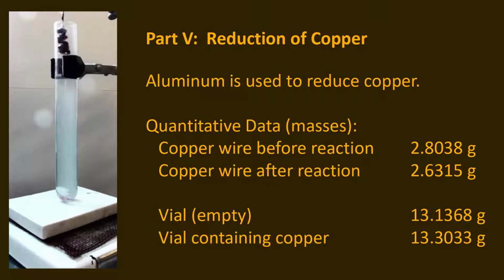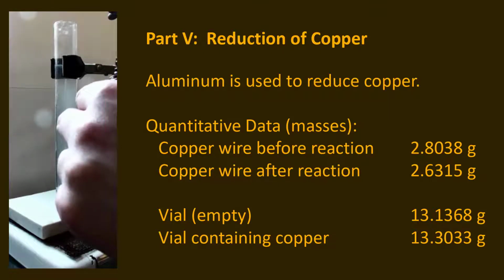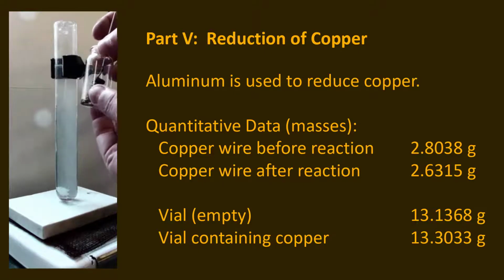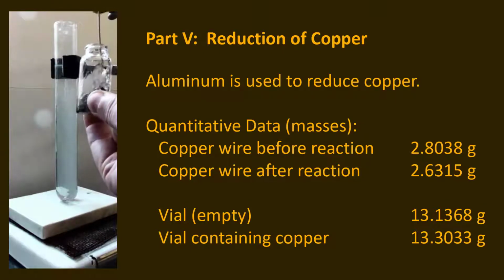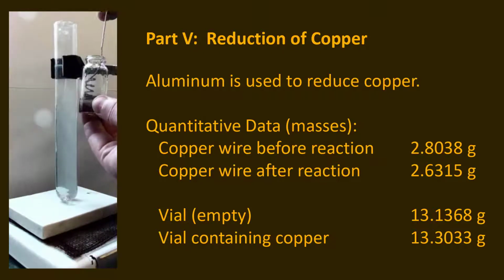So in this case, I'm just doing a delicate rinse, and usually, if this is a reasonably tight spiral, then you can get all or most of it into your container. Now I'll add a little bit of water and shake my piece of wire around in there.